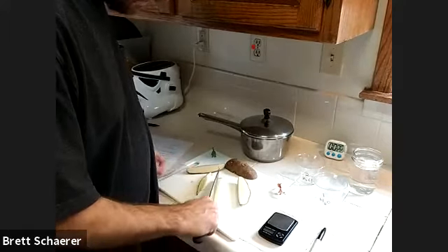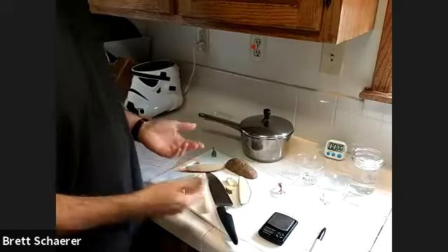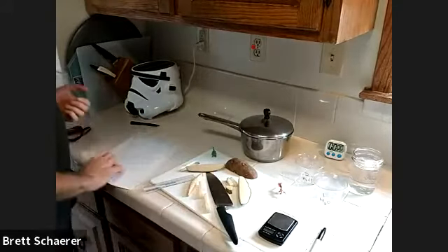Potatoes I'm using are kind of old, so they're a little bit less turgid than they would normally be. So now I've got 2 comparable pieces of potato here. And here's where we need to record some data.